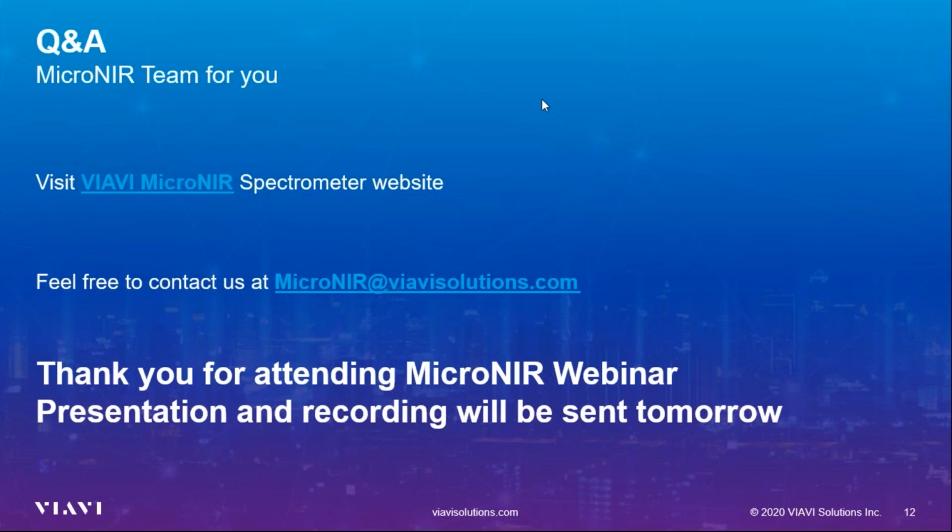Another question, maybe Cristina, you can take this one, is whether it makes any sense to select individual wavelengths versus an overall region. What do you think? So this is a nice question for a chemometrician because we think multivariate, so we don't want to use a single wavelength. And what I can ask is, why a single wavelength? If these wavelengths that you want to select are so important, they will arise also if you take the whole spectra. It is different if we are speaking of selecting a region, an interval of wavelengths, not just one wavelength. And it's different because I'm taking into account specific chemical information and the knowledge that I have before.